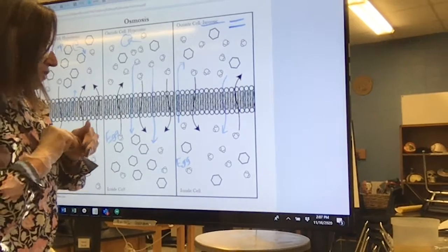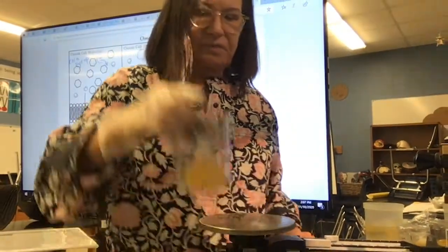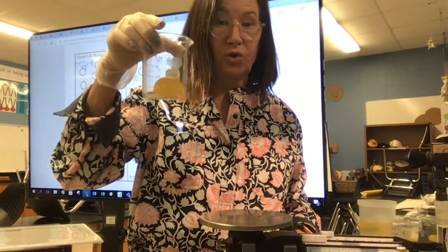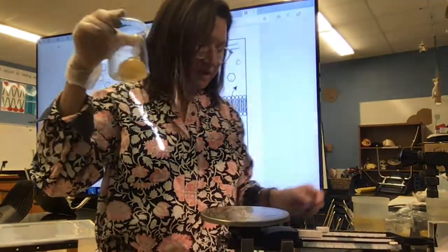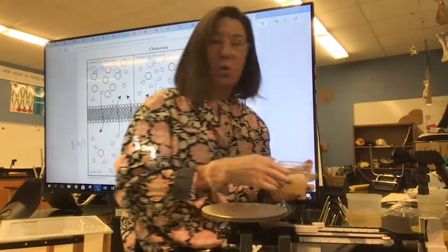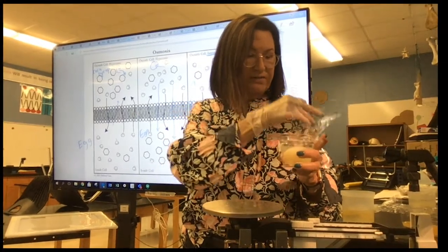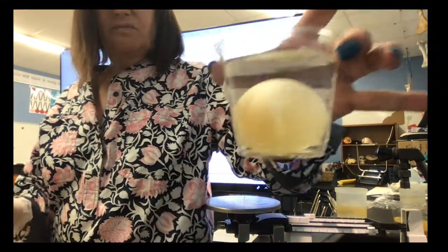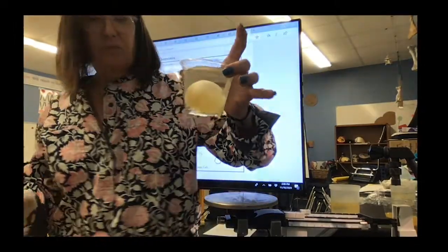Okay, so now what we're going to do on this final day is we went from here, right? And now this was called hypertonic, right? Because water left it. It went out of the cell. So we had put it in water, just plain water, right? And so here is what I have now. And if you look at it, look, it's all big again. And what do you think happened?